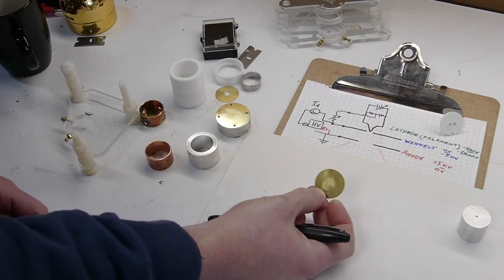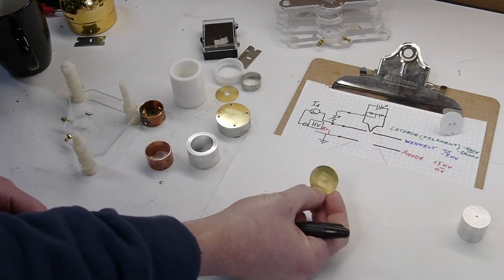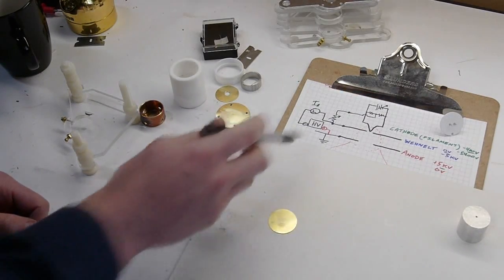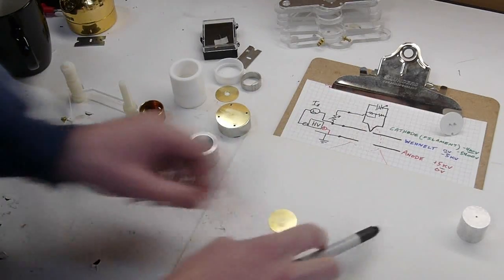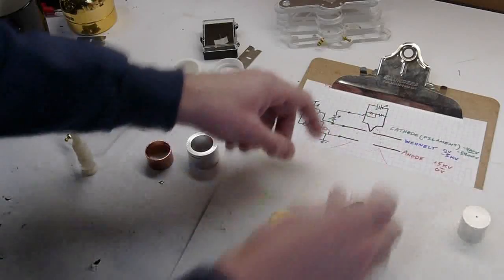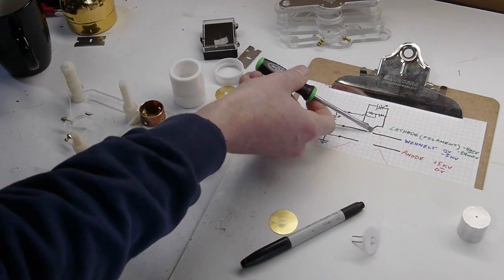And the hole in the Wenelt cylinder is about 500 microns or half a millimeter. I think I might have gone up to 750. The spacing between the filament tip and the Wenelt cylinder bottom, the actual distance between the very tip of the filament and the actual bottom of the Wenelt plate is quite low.